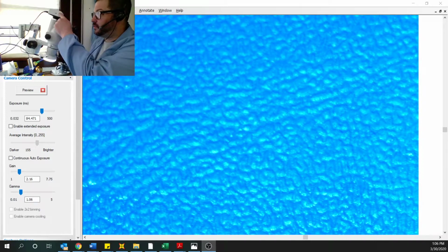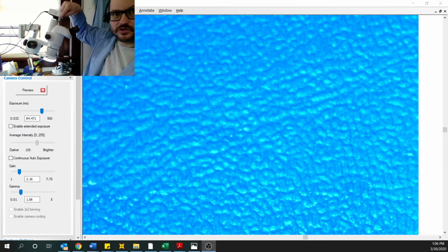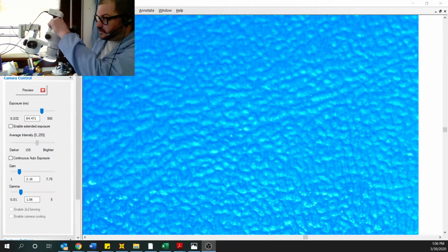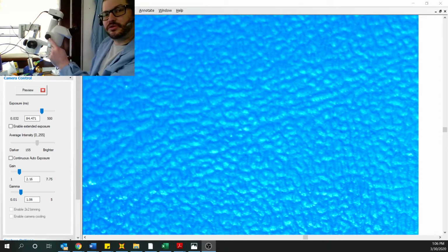Now, this weird looking unit up on the top is actually my camera, which is looking down what we call the zoom tube. There is a lens system that the camera looks down, and it first gets to this little knob right here. This is how I control zoom magnification through the zoom tube.